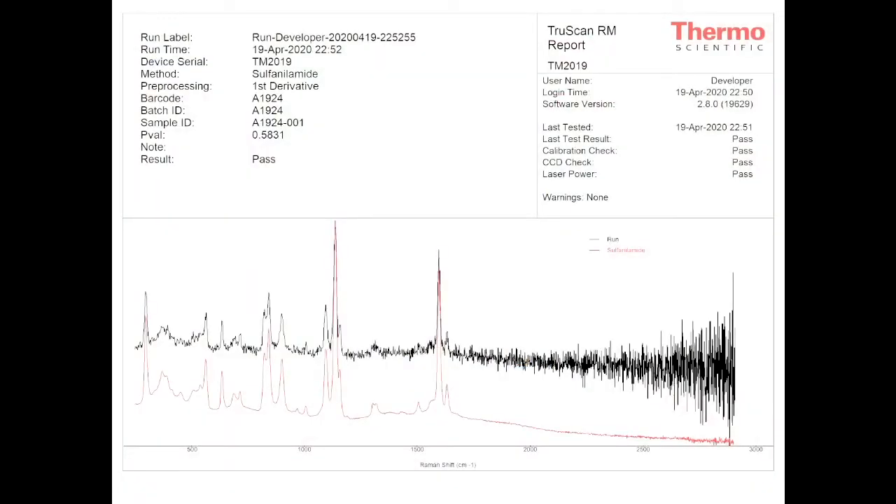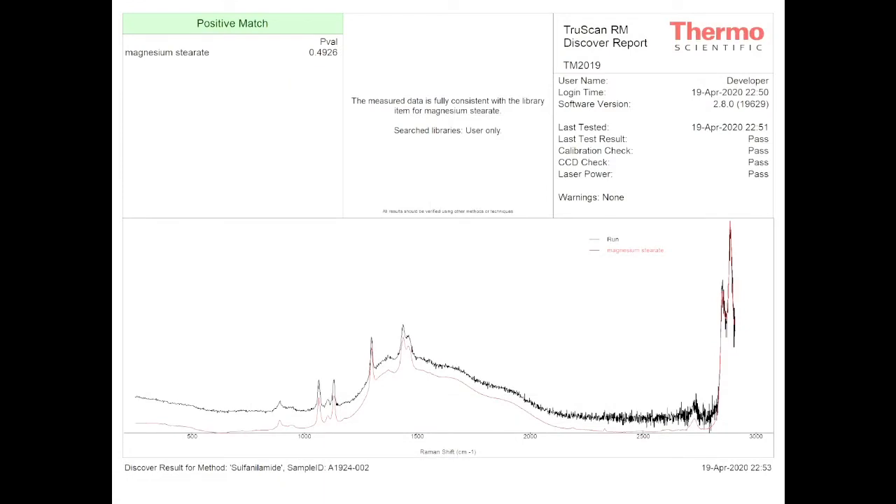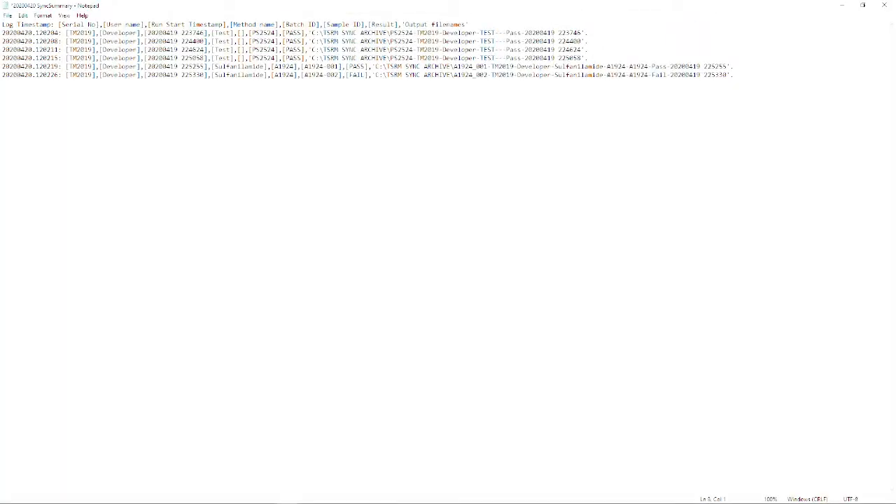Here's an example of a sample run report PDF. On the report, you will see the user who generated the data, a time date stamp for when the run was generated, and the instrument's passing performance qualification results. Most importantly is the passing p-value and the overall result of the sample run. A graphical overlay of the sample scan and method signature is displayed for visual inspection. Here's an example of a batch report in CSV format, which is easily parsed by a LIMS or a suitable data management system. For failing results, a discovery report is generated that shows the positive matches found. The sync summary report depicts where the data files were sent for archival upon sync.